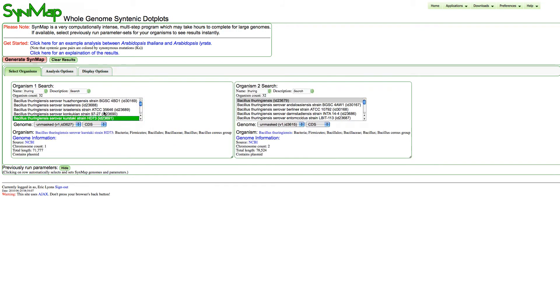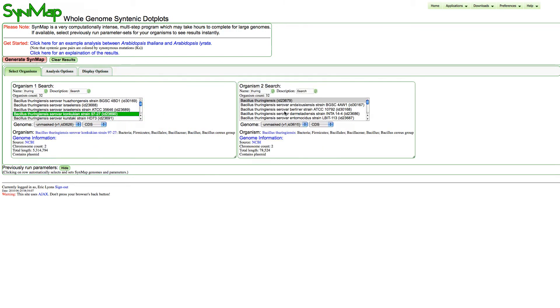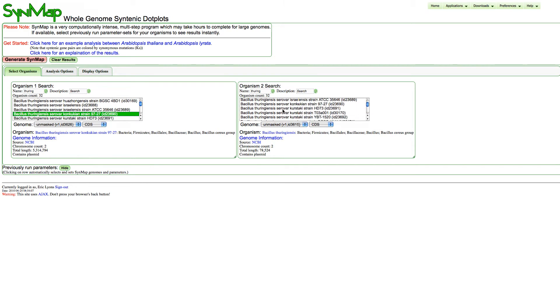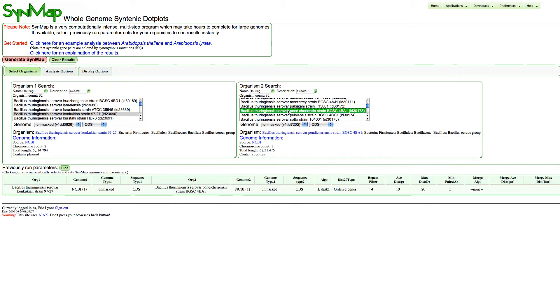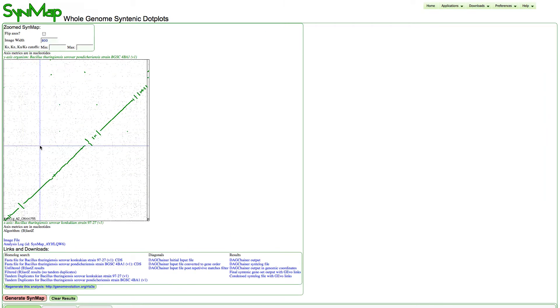One will be this strain, and the other will be this strain. Once the two genomes are selected, I can see they're unmasked and we have coding sequence. To run it, all I need to do is press the button generate SynMAP.